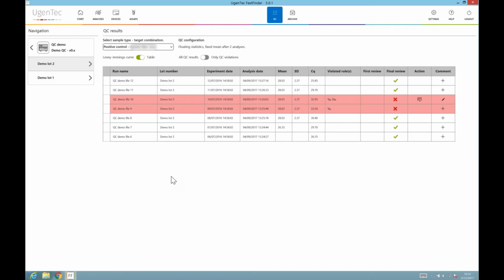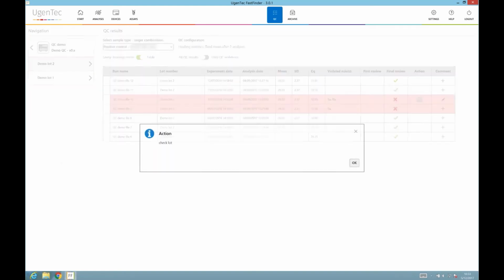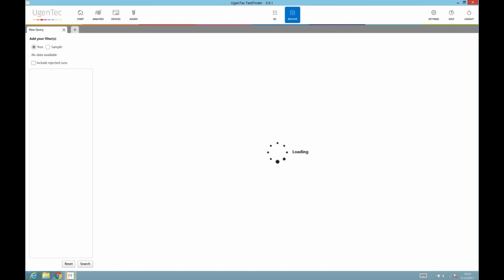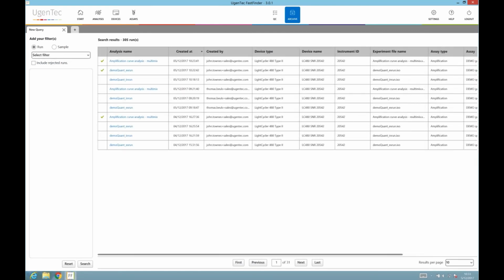And as you can see, I can apply actions here in an audit trailed way. And of course, I can have an output and control of which Westgard rules I'm applying in my laboratory. So what do I do with that information in terms of reactive troubleshooting? So as we said, we've got this very nice tool, which is the real-time quality control tool.